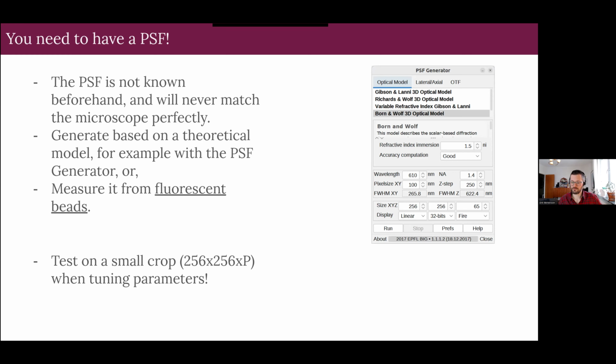And yeah, I think you will see later on in the lecture from Nikon that there are other options also, but there are for sure faster programs than the Deconvolution Lab at this point. But this is very good for learning. I think still it's superb. It's just that no one would use it for high throughput data anymore.